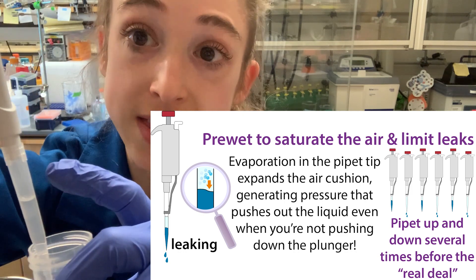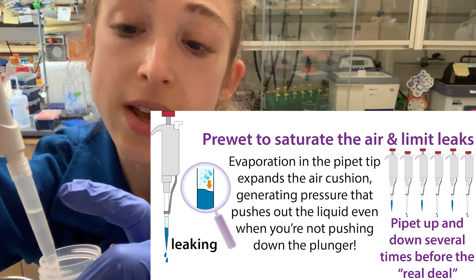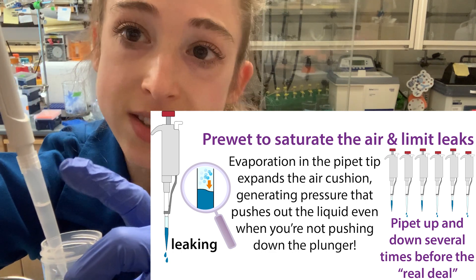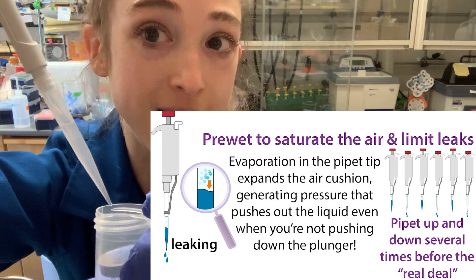What's going to happen is that the rate of evaporation — the ethanol evaporating — is going to equal the rate of condensation, the ethanol going back into liquid form. So when you pipette, it will still be at that equilibrium, and you're not going to get a change in volume or dripping.